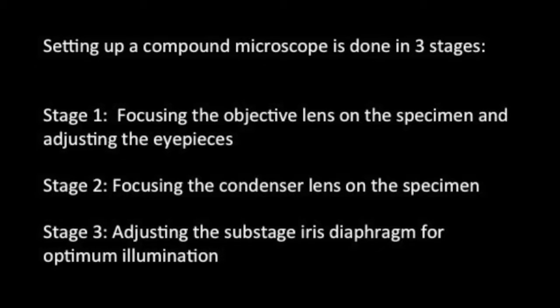Setting up the compound microscope is done in three stages. Stage one: focusing the objective lens on the specimen and adjusting the eyepieces. Stage two: focusing the condenser lens on the specimen. And stage three: adjusting the substage diaphragm for optimum illumination.